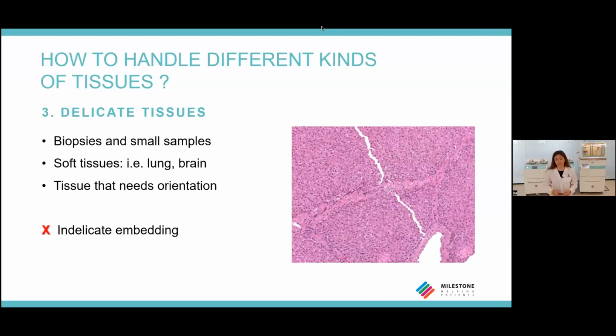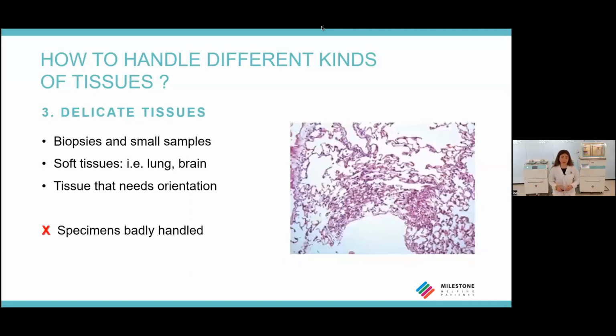require a specific orientation. As you know, with these specimens, the embedding step is a crucial one, because if specimens are handled forcefully to make them lie flat in the mold, they can also be easily broken, like the example in this image. Another problem is that samples can also show signs of local deformation due to rough handling with the forceps.